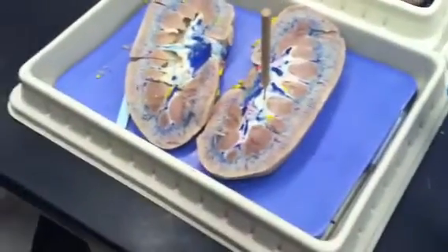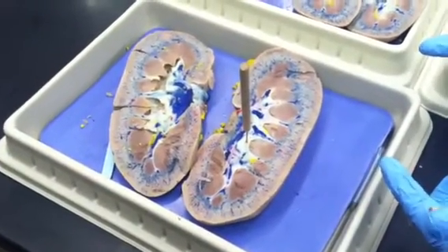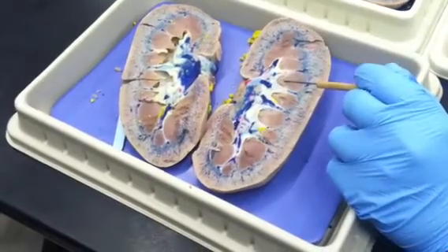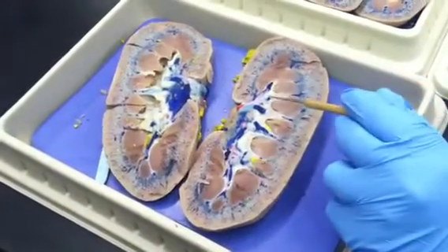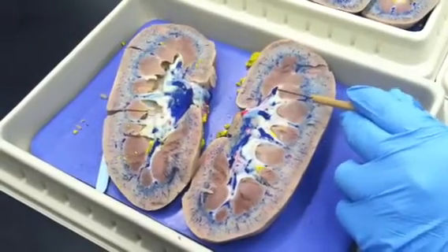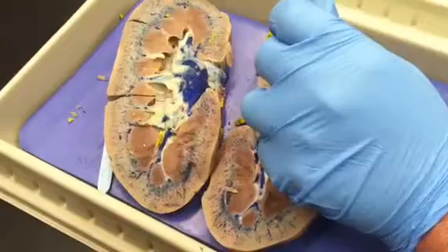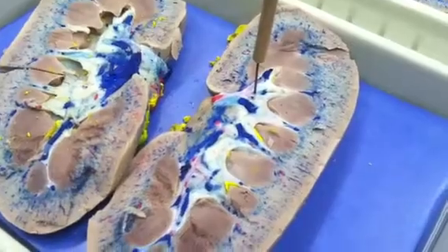Now, typically minor calyxes merge into a larger area of the sac, and that larger area is the major calyx. So probably the best areas to reduce confusion are typically on the ends. If we come down here and look at this pyramid, 1, 2, over here there's 1 or 2 pyramids, maybe 3. But the minor calyces coming from these pyramids are all emptying into this general area of the sac. And so if I take my probe as much toward the center of that area as I can, it's a major calyx.